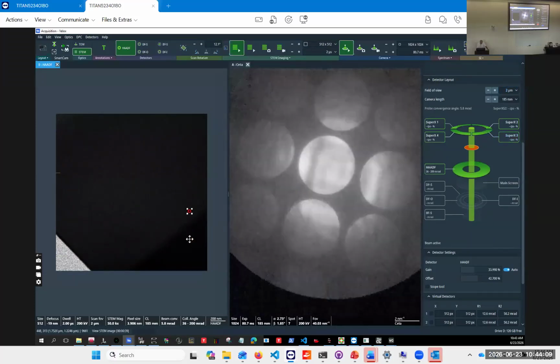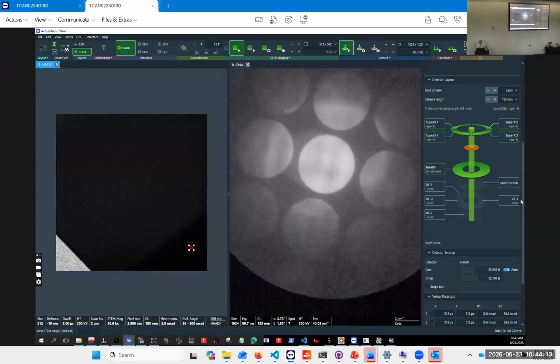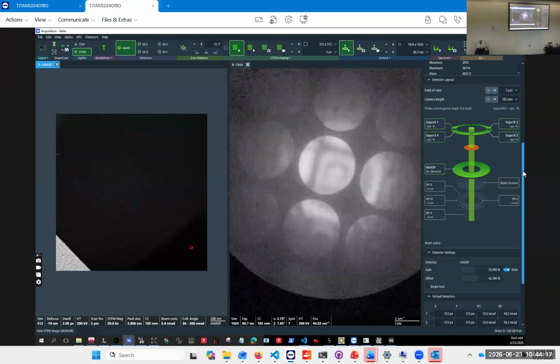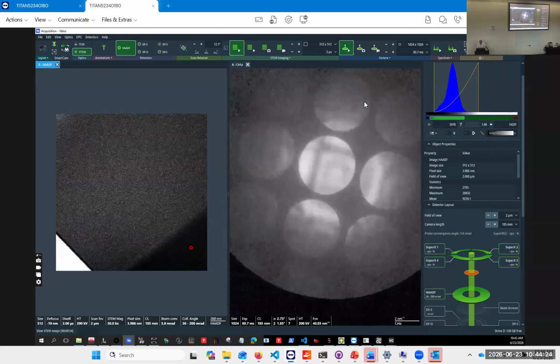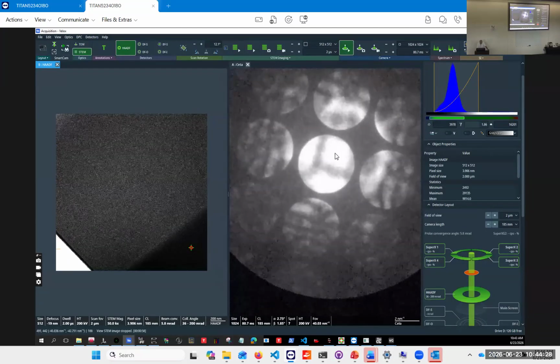So let's go to a relatively large point here. Let's go down to the thin bit. We see here, not sure it's clear. So this one is considerably thinner than this one. And if we stop it, we see it is tilted.